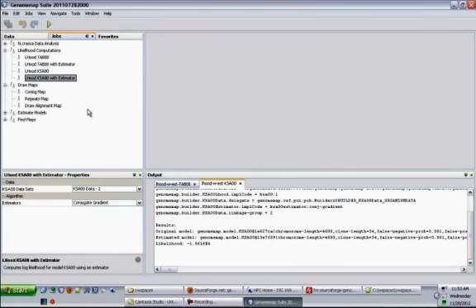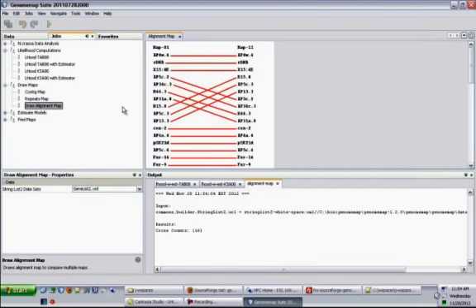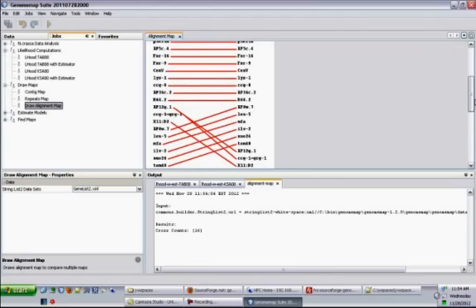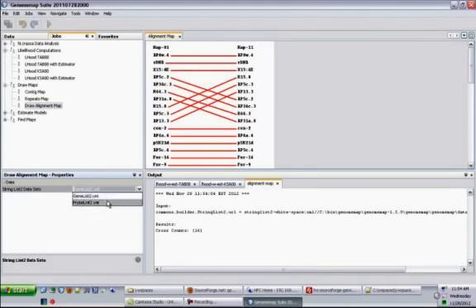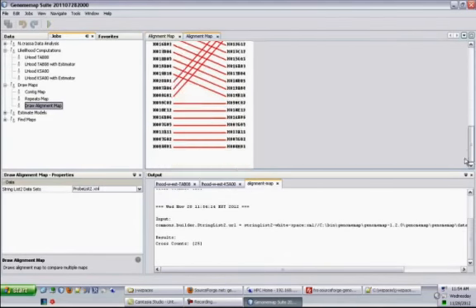We have added support for the alignment map. We can draw alignment maps for genes and also probes, and we can also add support for more than 2 maps by editing the input file. So here, 2 maps. Here, say another file. This for the probes.